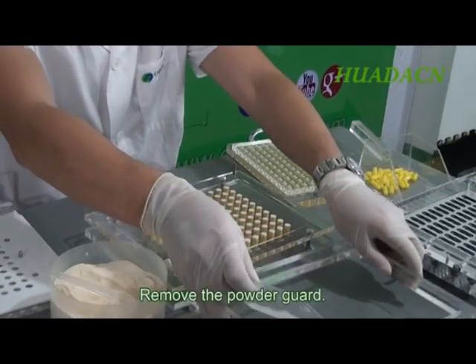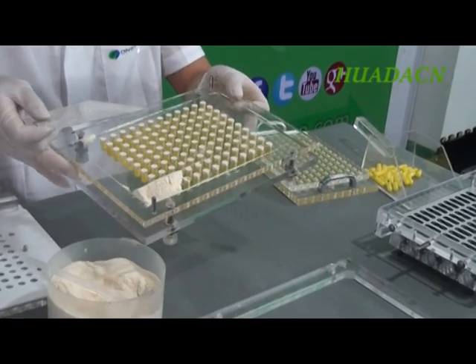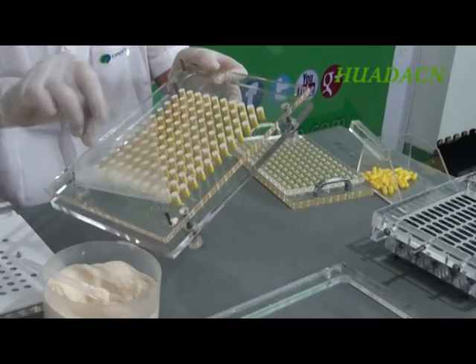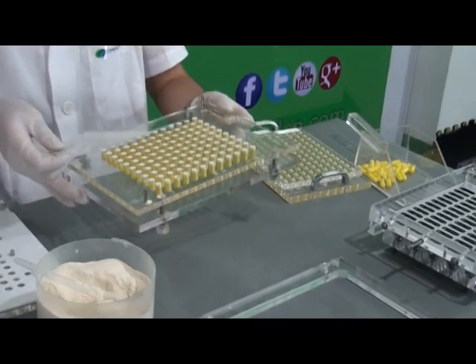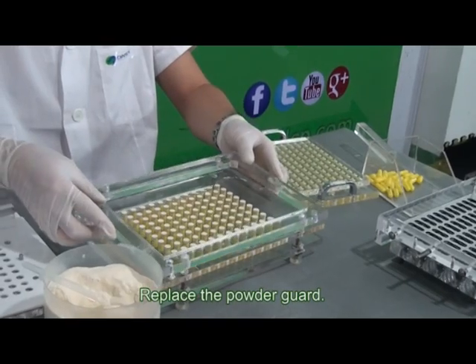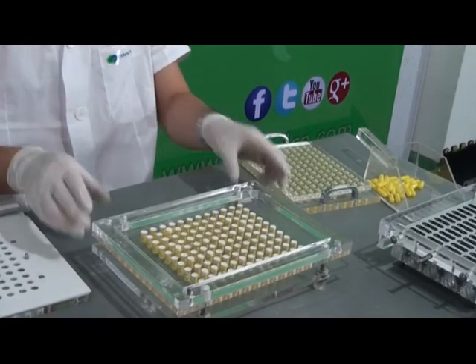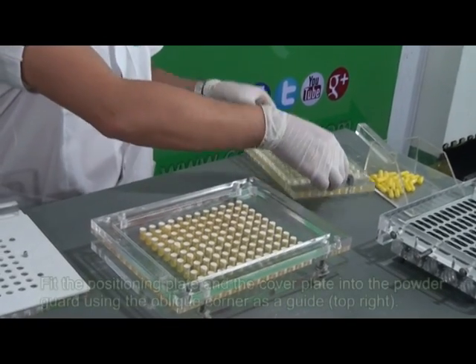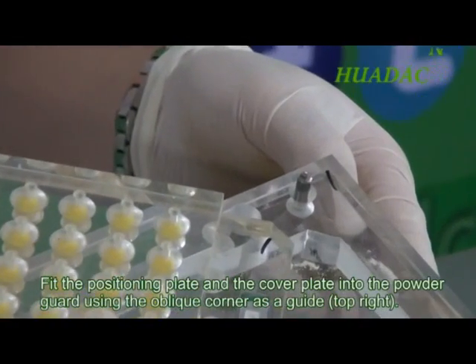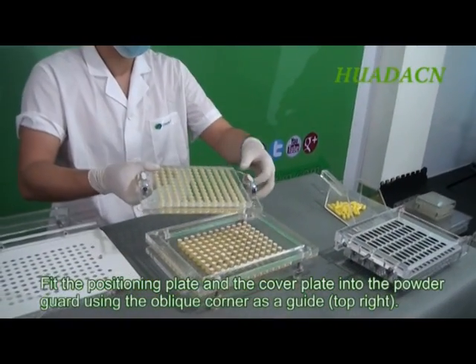Remove the powder guard and remove excess powder. Replace the powder guard. Fit the positioning plate and the cover plate into the powder guard using the oblique corner as a guide, top right.